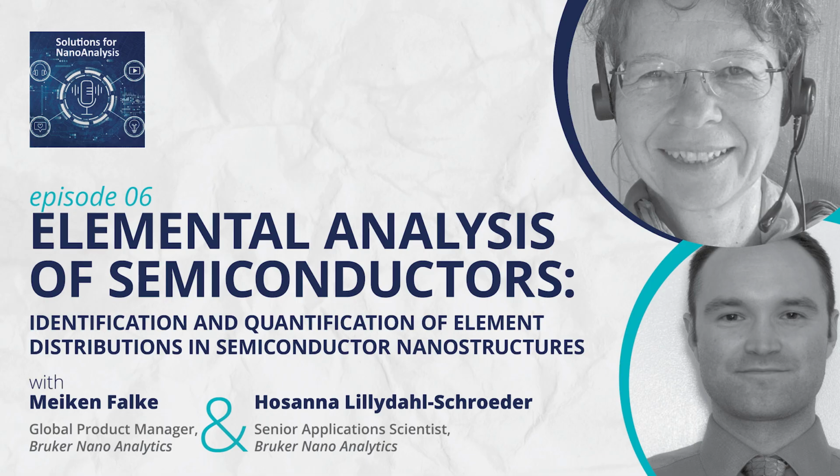Yeah, true. There are quite a few overlaps, but that's maybe one step ahead. I guess where the question also comes from is, formerly, using EDS for light elements was an absolute no-go. That's why it's not widely spread yet in life science, because formerly, when we were still in the lithium-drifted, liquid-nitrogen-cooled EDS era with beryllium windows, the detectors were not so efficient for the light elements, but they have become so good now.